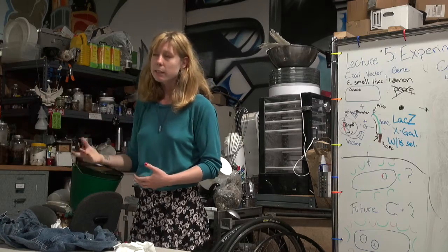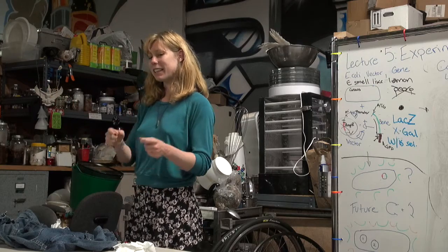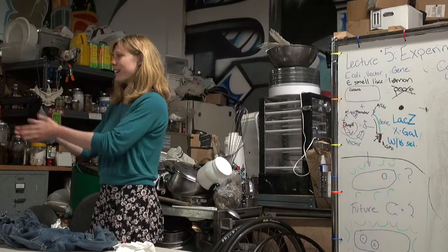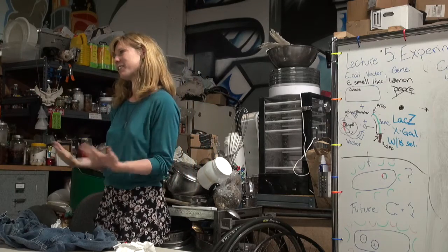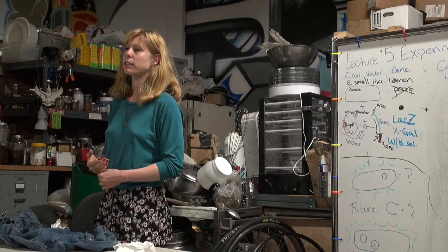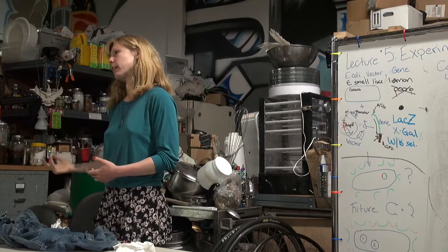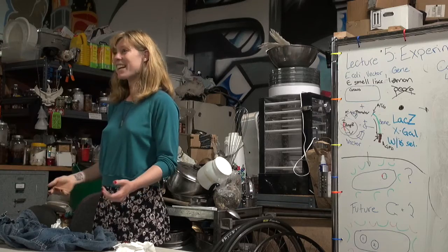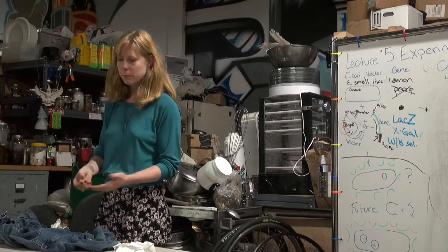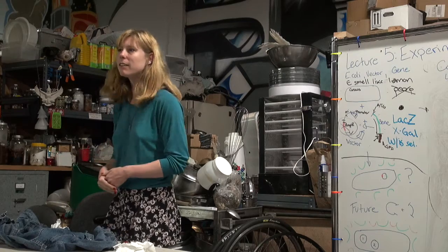To understand the quality of the plasmid, really what we need to do is a transformation to see if indeed the plasmid that we harvested had the ability to give new abilities to just a good old competent cell. But we could have known that it doesn't really matter if you don't resuspend that pellet of cells. Yes, you will still get plasmid, but you get less, or it just doesn't matter. In fact, it may matter which order, or you could switch things up. Always try it, like, oh, I messed up, right? See how you messed up, and you'll see if it actually matters, or what effect it does have.